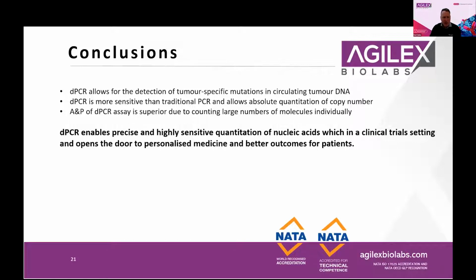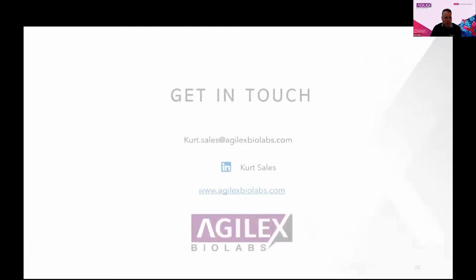And so the take-home message really is that digital PCR enables precise and highly sensitive quantitation of nucleic acid, which, as I mentioned, in a clinical trial setting is crucial and opens the door to personalized medicine and better outcomes for patients. And on that note, I will thank you for your attention and am happy to take any questions.